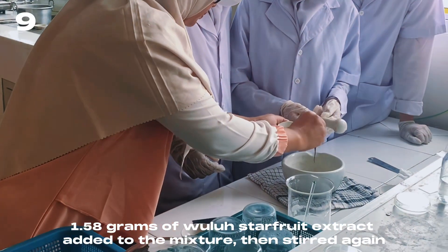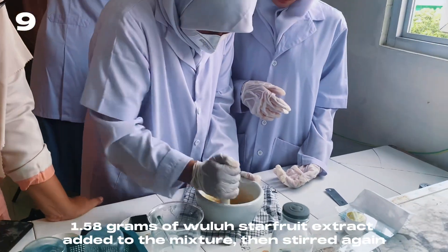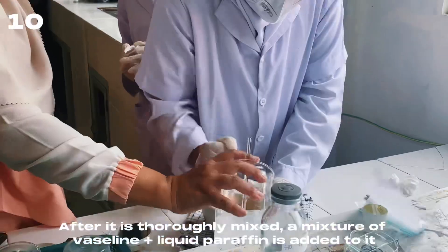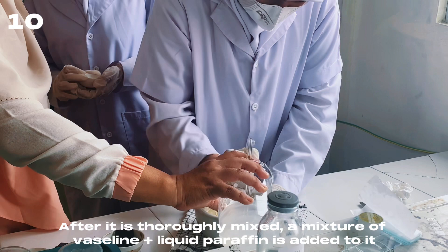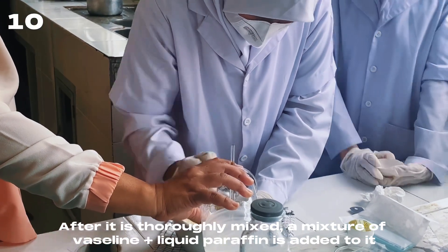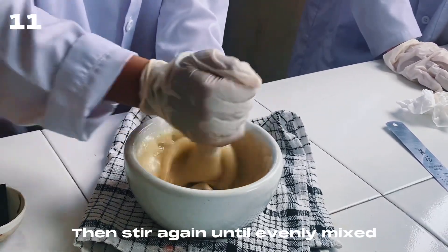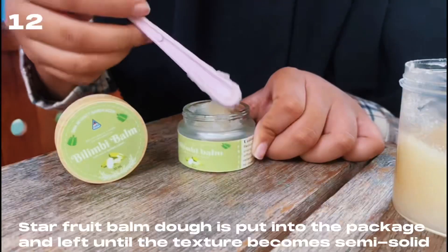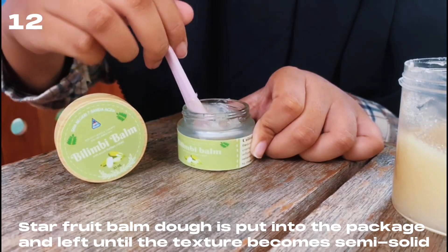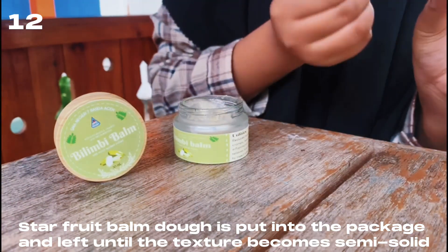1.58 grams of star fruit extract is added to the mixture and stirred again. After it is thoroughly mixed, a mixture of Vaseline and liquid paraffin is added to it and stirred again until evenly mixed. The star fruit balm dough is put into the package and left until the texture becomes semi-solid.